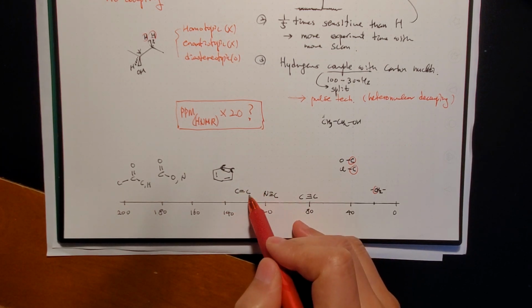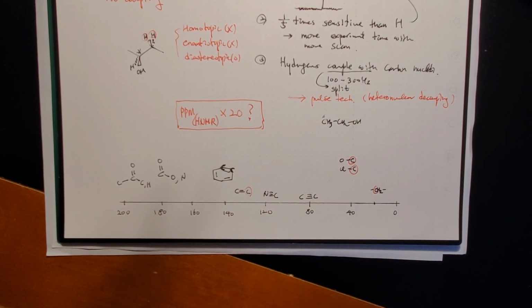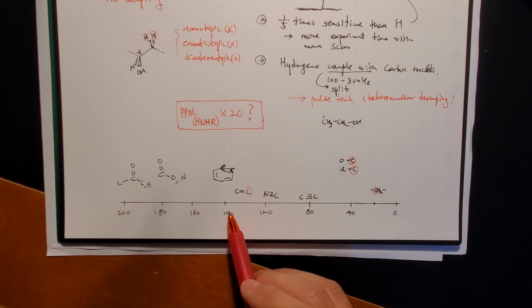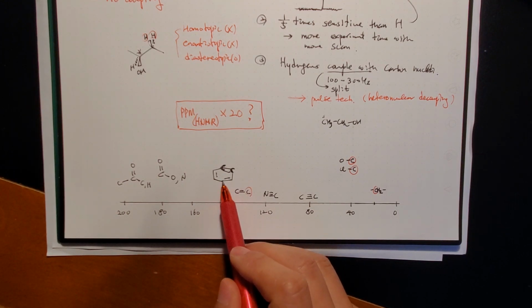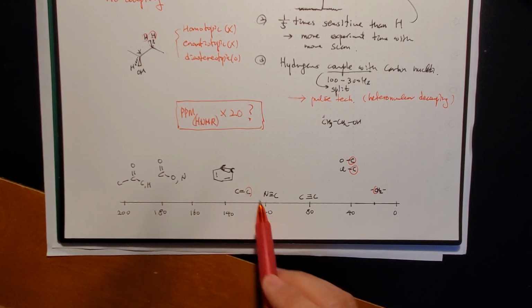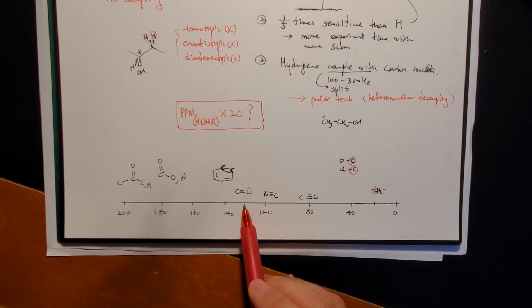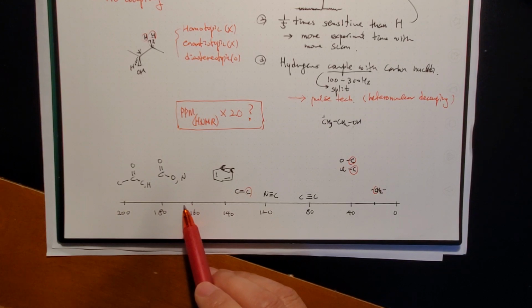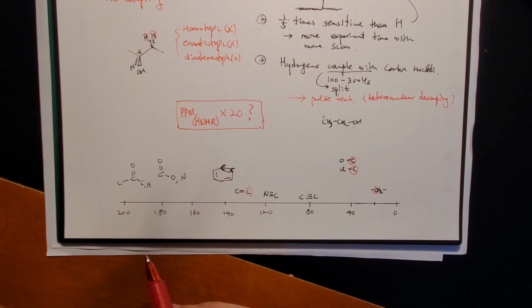Regular alkene carbon comes in. It was 4 to 6, but here 120 to 140. And then the benzene aromatic carbons can come in the middle of this area somewhere, like 130, 120-something is possible too. Go to 160, but it could go over 160, depends on what you have. You should apply resonance and inductive effects to deduce the changes.